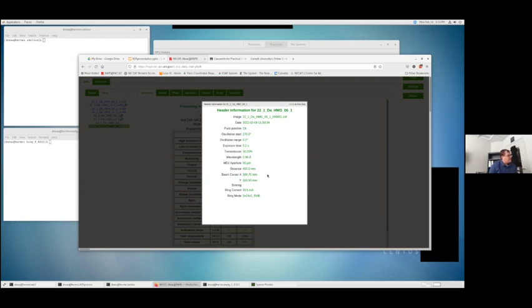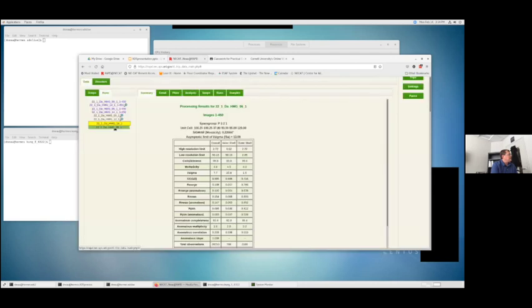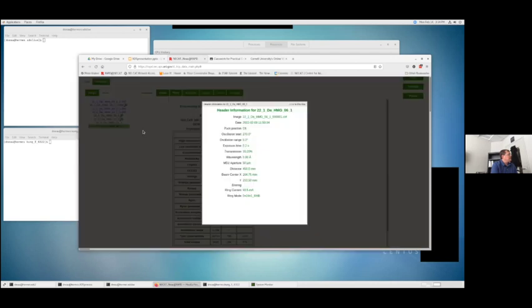Okay, and this presents the beam center in millimeters. Unfortunately, what XDS wants is the beam center in pixels. So although this is useful, and you can calculate it based on the pixel size, I'll show you a different way of getting that beam center that Rapid uses. Okay, but if you for some reason did not write down the parameters of your data sets when you collected them, coming in here to Rapid and right-clicking View Header is an easy, simple way of retrieving those parameters.